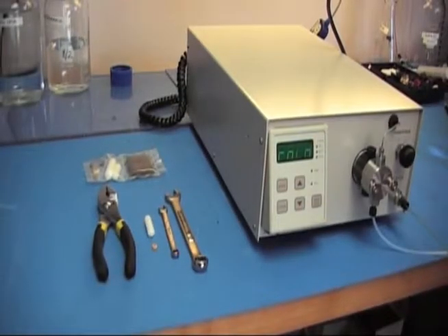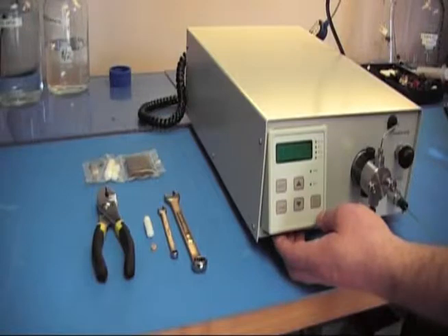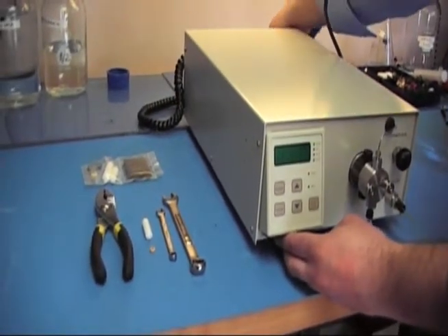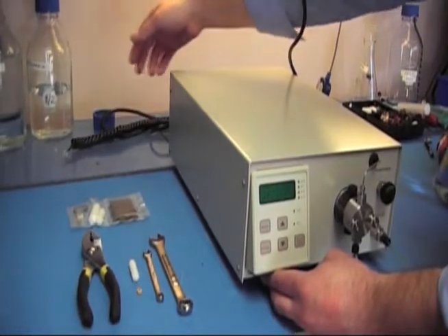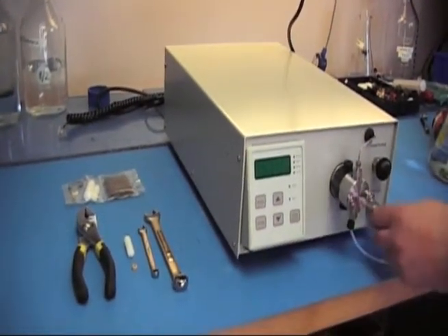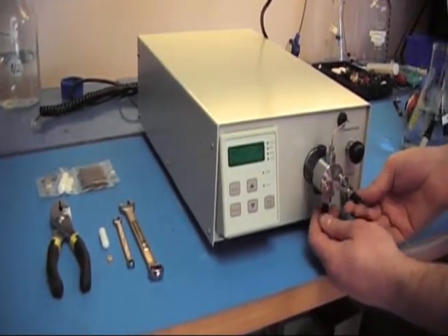Before we get started, make sure you power down your pump, make sure your power cord is unplugged from the back, as well as any communication lines you may have hooked to the back. And remove all tubing from your fluid path, your outlet and your inlet.